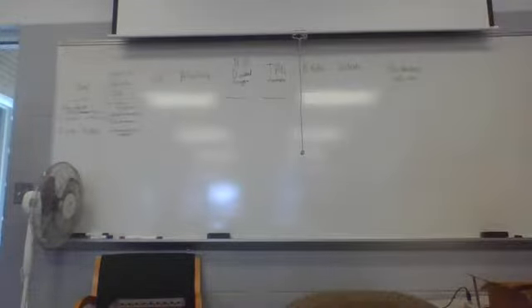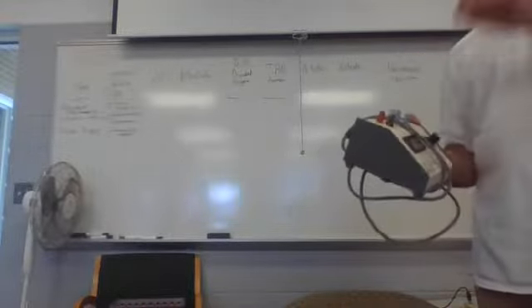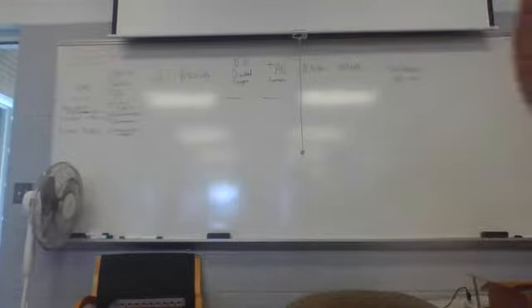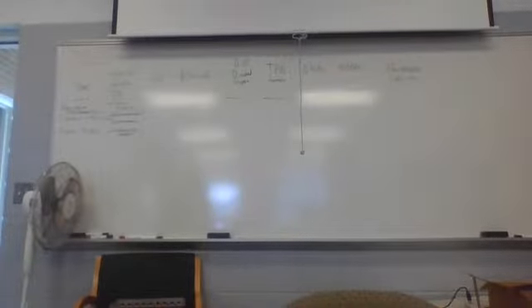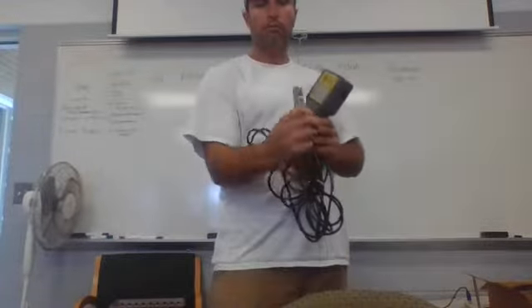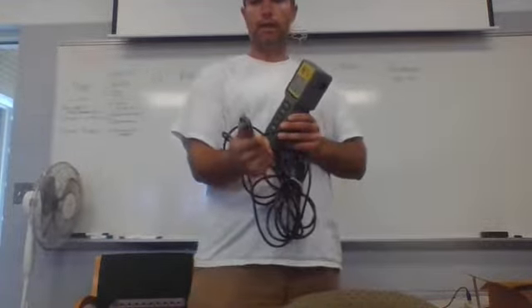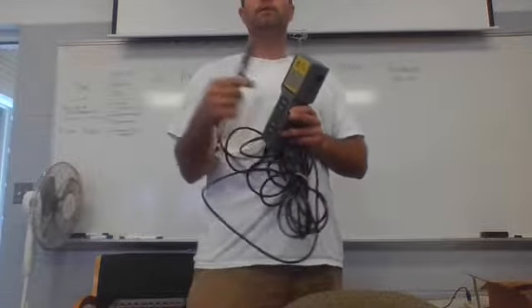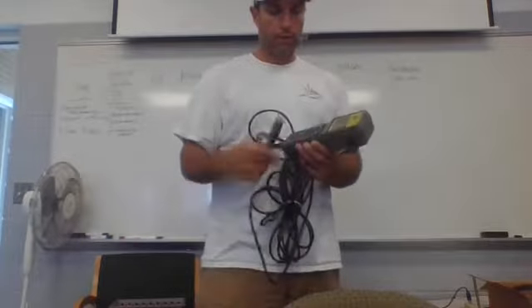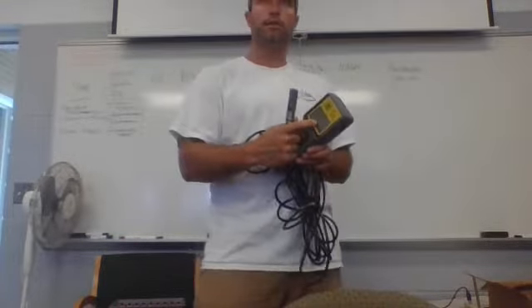There's another one here where you kind of do the same thing, but you put probes into the water, which I don't have anymore, so that's a really old one. But nowadays, it just looks like this. You turn it on. There's a little probe here. It's the same idea. There's two holes, and it sends an electrical current through the water, and it measures how much transfers across, and it just gives you a readout here.